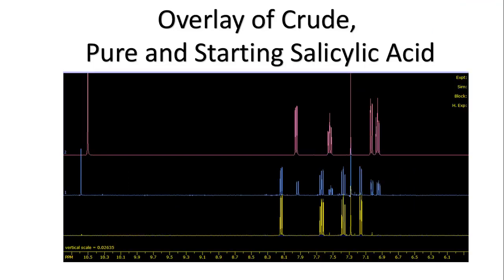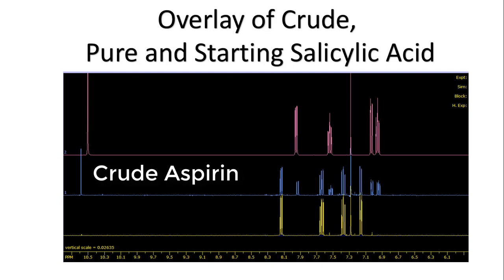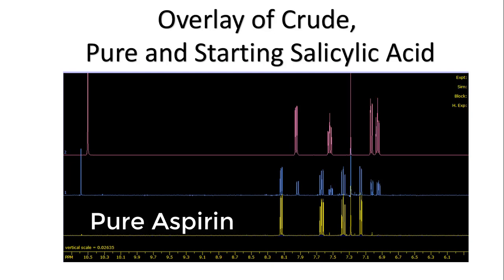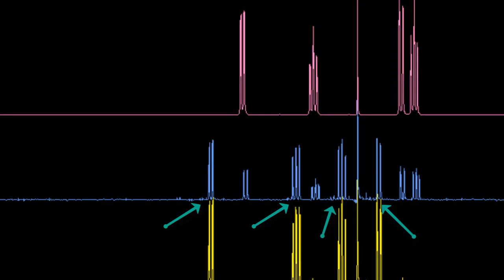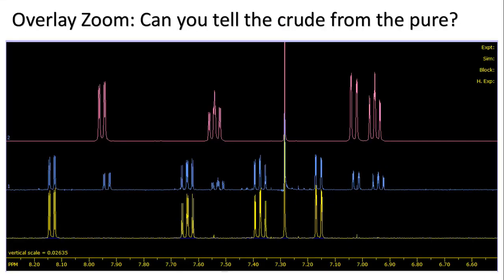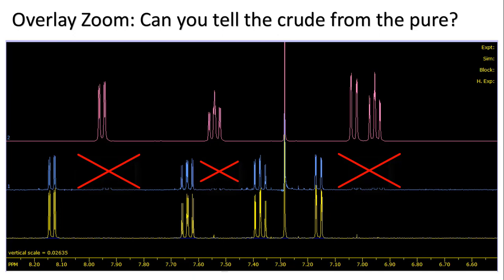Here's the overlay: the top spectrum is salicylic acid, the blue middle spectrum is the crude, and the lower spectrum is the pure aspirin. You can see the difference clearly. If you look at the crude and salicylic acid, you can see that these peaks match up. If you look at the crude and the pure, you can see where the pure aspirin aromatic peaks show up. By process of elimination, you can subtract out the salicylic acid from the crude and compare it to the pure to see what you have.